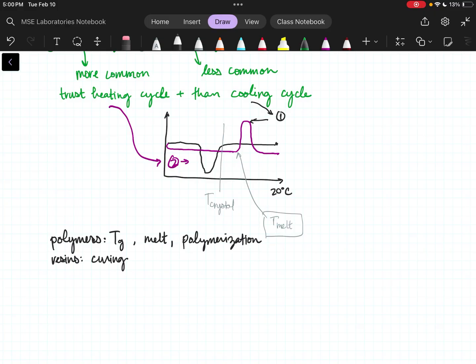That's usually endothermic or exothermic. We can do metals or salt or whatever else for melt. Sometimes we'll do liquids for evaporation temperature. Basically, if you can fit it into that crucible, you're going to be able to do well with it.